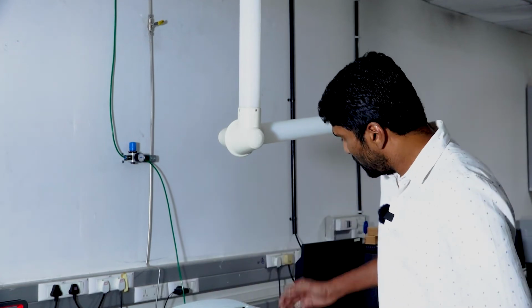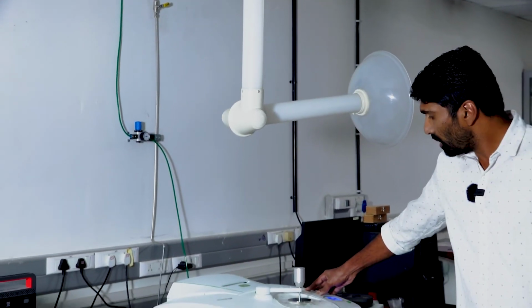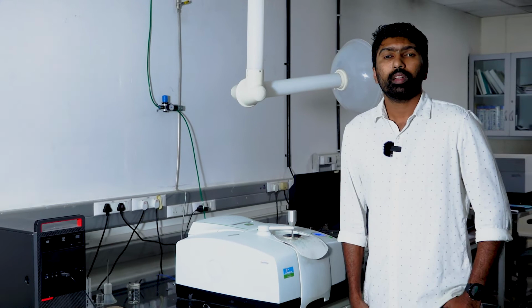Currently you are at the Characterization Facility of the Center for Nanoscience and Engineering, and we will be demonstrating how to use an FTIR facility and how to interpret the data. This is the FTIR spectrometer, and FTIR stands for Fourier Transform Infrared Spectroscopy. As the name suggests, it is an infrared spectroscopy which deals with the vibrational spectra of a molecule.